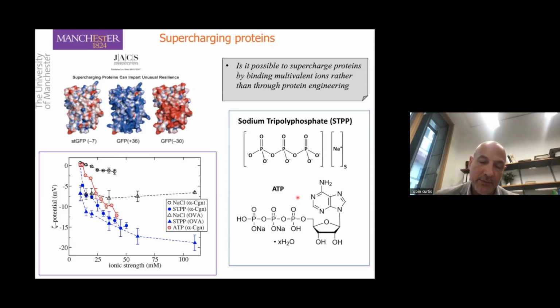People were claiming that ATP acts as a hydrotrope, where the adenosine group will bind to nonpolar regions, and the phosphate group will lead to a protective layer around the protein due to its high hydration. But we were also wondering whether this effect of ATP could be related to overcharging proteins.